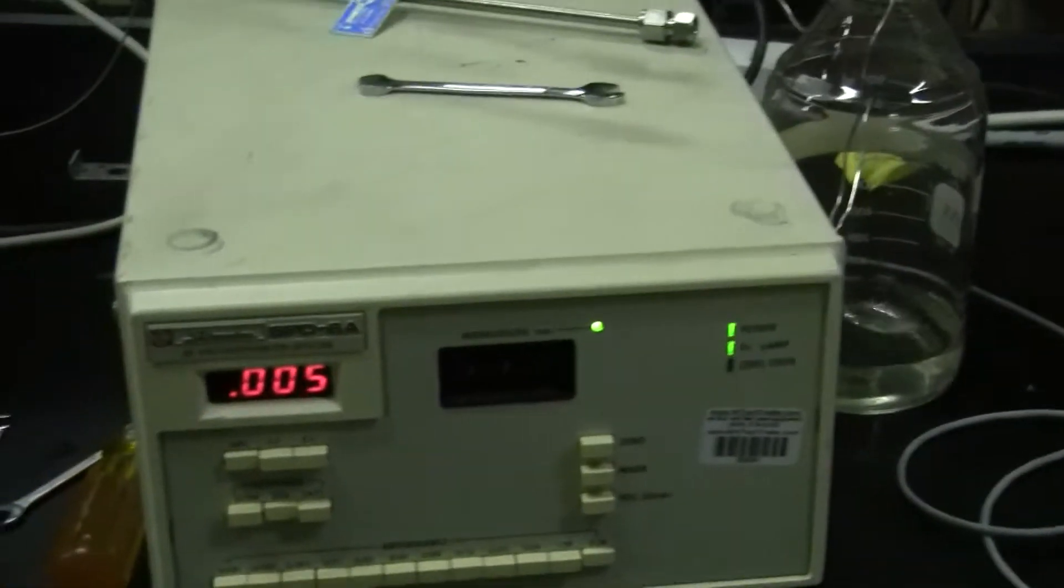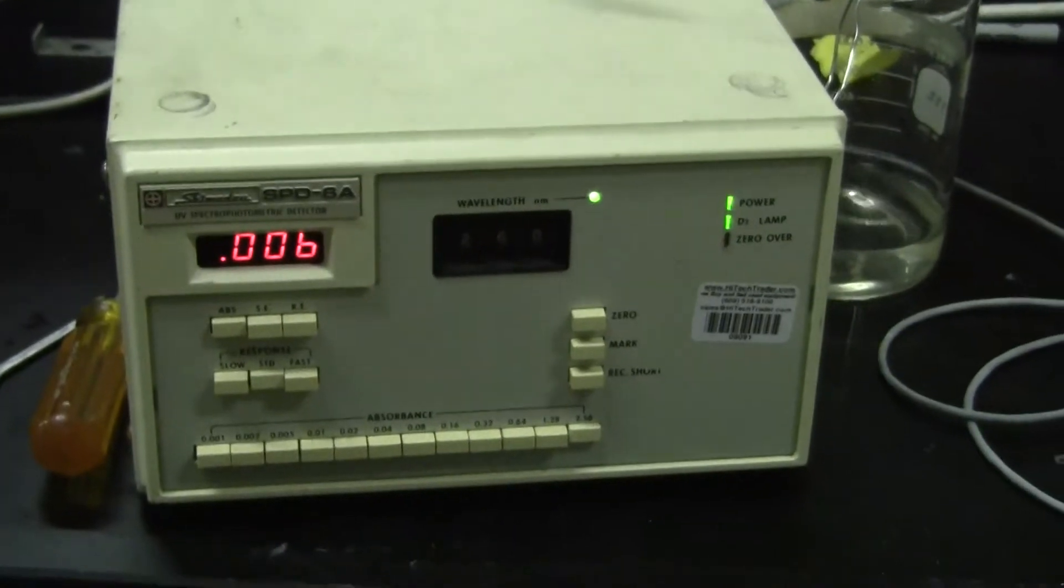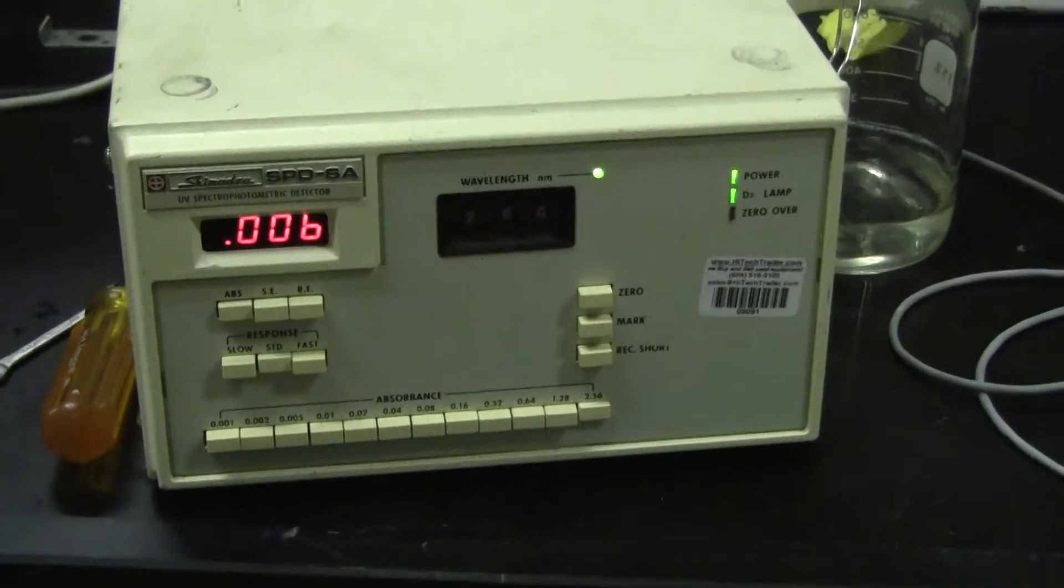Hi, this is Michael from HitechTrader. Today we're looking at a Shimadzu SPD-6A UV Spectrophotometer Detector for liquid chromatography.